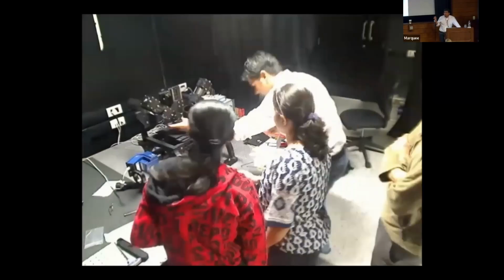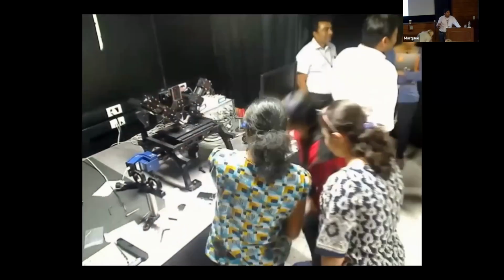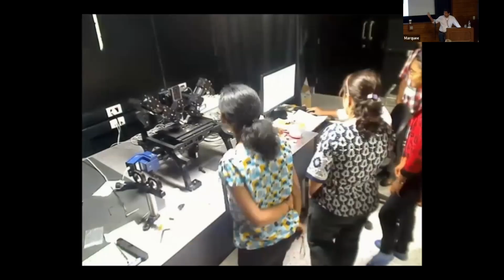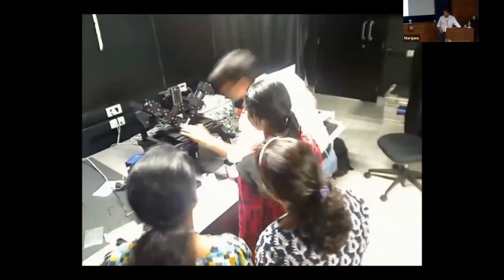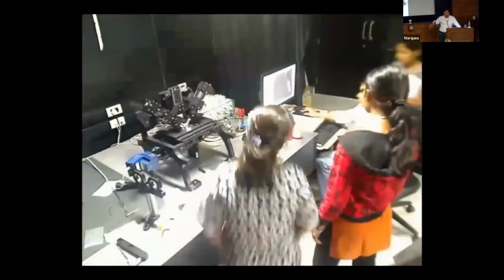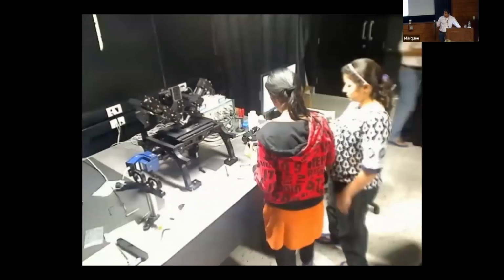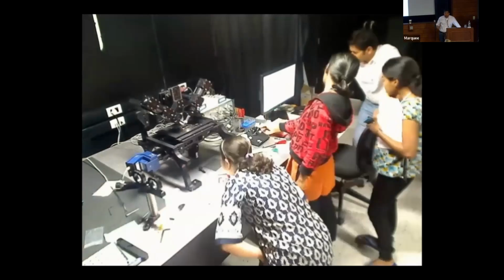So we thought this would be a good learning project for us, Hari and me, to see if we could build this. We thought that nobody was going to sign up and we'd get 2 days off, but 3 students signed up. And I give them credit, they had never touched a microscope before coming to this course. They were all biology graduate students, but they wanted to build a microscope and get their hands dirty. So we started from scratch, an empty optical table, and they built this microscope in 10 hours. And the next day they put in some samples and got some data.